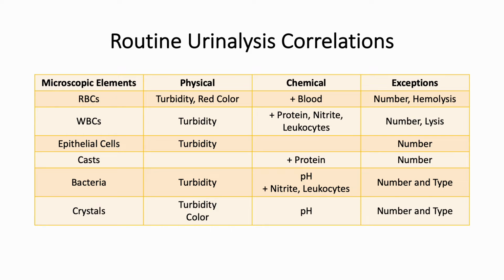However, the amount of formed elements or chemicals must also be considered, including the possibility of interference with the chemical tests and the age of the specimen.